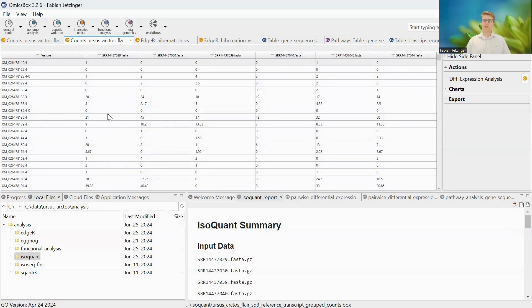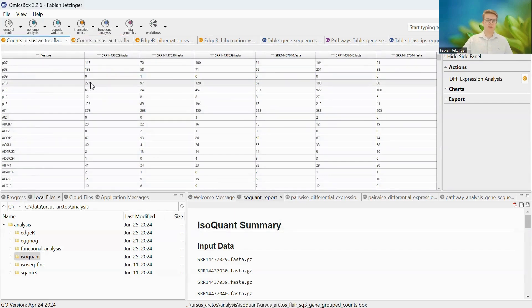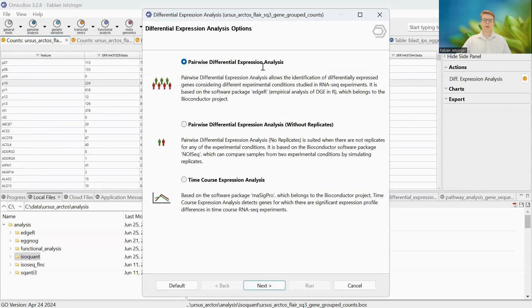We have successfully quantified our long reads based on our existing transcriptome. Now we want to compare our two conditions — hibernation versus active — to identify differentially expressed genes or transcripts. We can simply go to the gene-level quantification table and in the sidebar select the option of differential expression analysis, choosing between pairwise differential analysis, pairwise without replicates, or time course. Since we have three samples per condition, we can work with EdgeR.